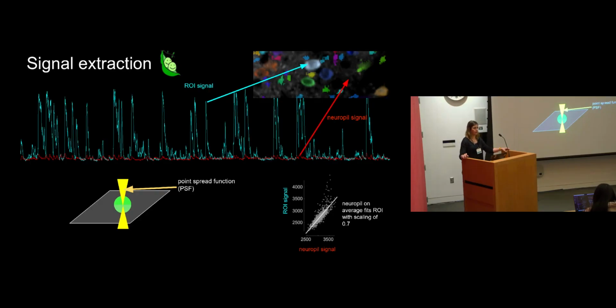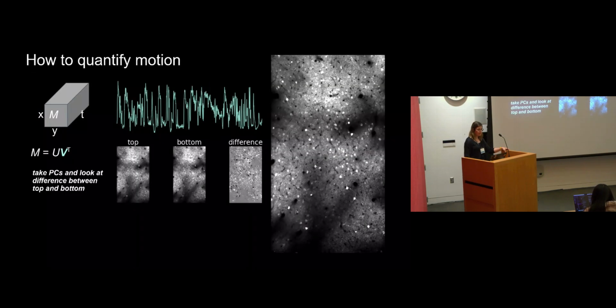Yeah, it's a good question. Yeah. Related to the motion correction part. So you mentioned you're also able to correct a little bit the Z motion, right? How much is relying on this double plane imaging, and is it possible to do that if you just have one plane?